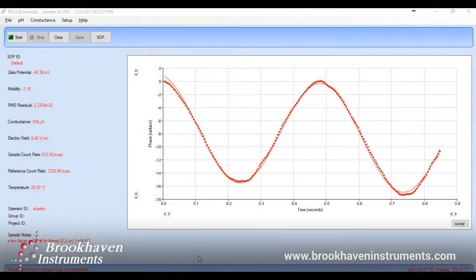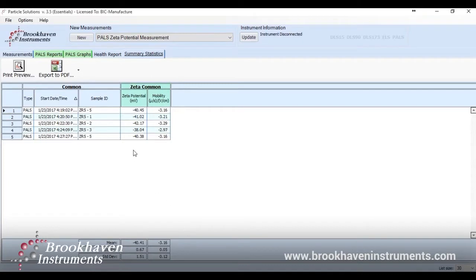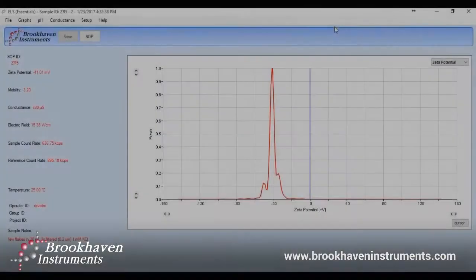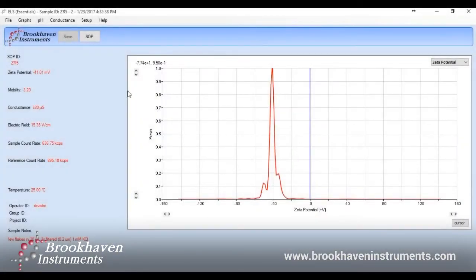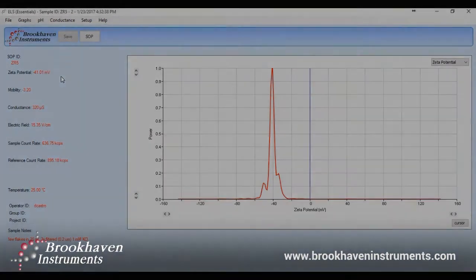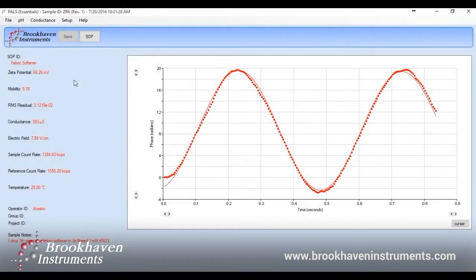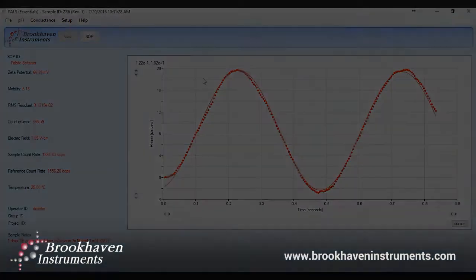Once the set of measurements is complete, you can review the results and change any parameters as well as see statistics on a set of measurements. This is an example of an ELS measurement. Instead of a phase shift like we saw in PALS, here we see a Doppler shift. We also have a positively charged sample called ZR6 that is fabric softener based, and these are the results. The positive charge is seen by the positive slope of the PALS curve.